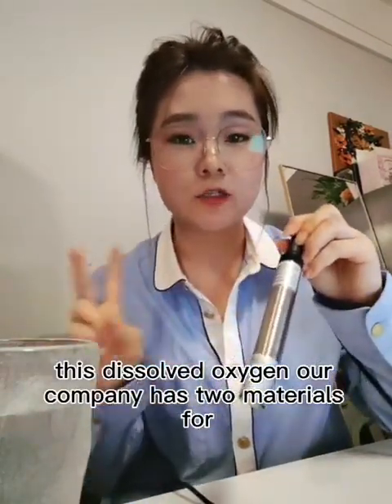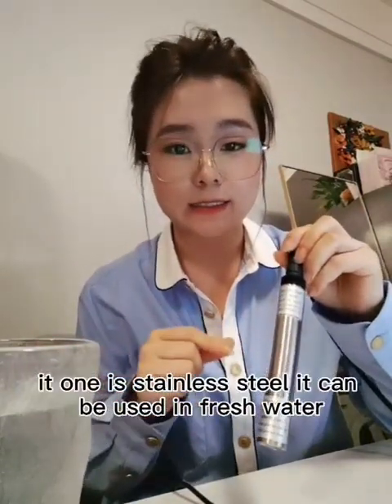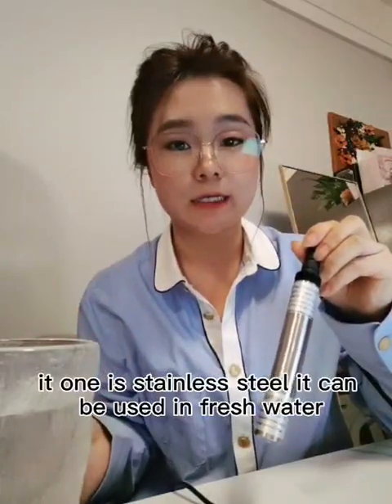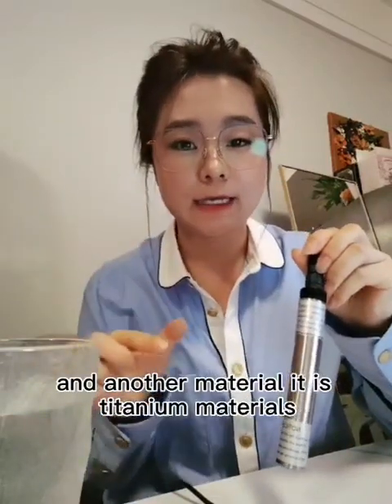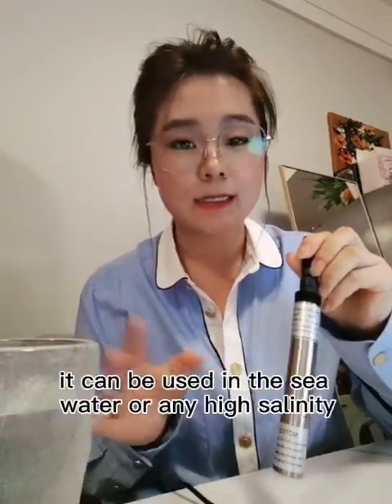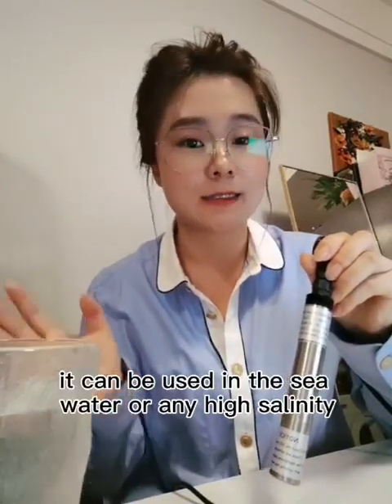Our company has two materials for this dissolved oxygen sensor. One is stainless steel, which can be used in fresh water, normal rivers, or lakes. The other material is titanium, which can be used in seawater or any high salinity environment.